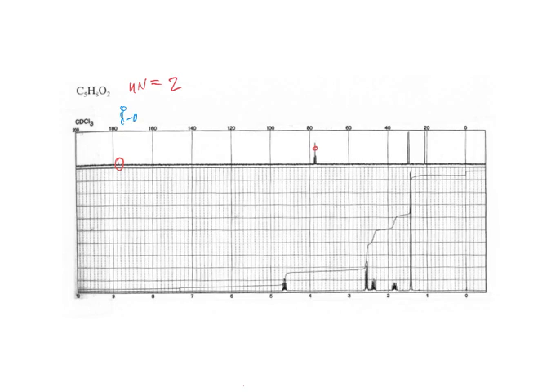And the other three are down between 20 and 40? Yeah, I guess there's two here and one here. Let's look at the integration. If this is 1, it's about 2, 1, 1, 3. So we have a methyl. I think it's a doublet, but you can't really see it. I'll just have to believe you. Yeah, it's too small to be able to see. That's interesting.